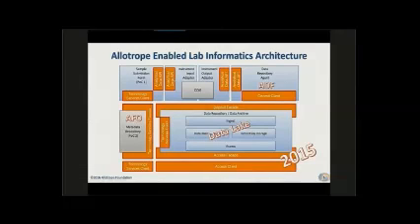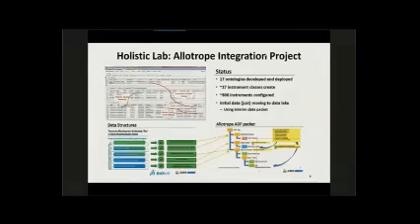That addressed one question I think someone asked this morning. When you have a lot of different terms, very similar, assay, analysis, how do you drive consistency? This AFO is driving that consistency, managing the taxonomy and then serving as a terminology service to all the upper layer applications. So all the instruments, all the data spit out can be harmonized, converted into a consistent data format, and eventually be uploaded into the data lake. Now all the data from all different instruments are in one place.